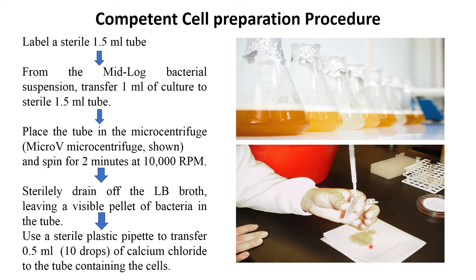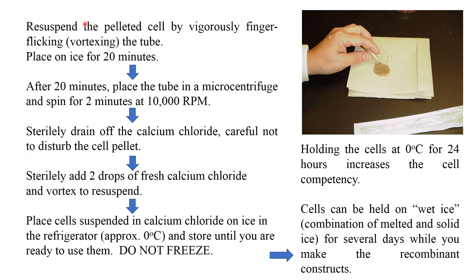After centrifugation, drain off the LB broth leaving a visible pellet of bacteria in the tube. Then use a sterile plastic pipet to transfer 1.5 ml of calcium chloride to the tube containing cells. Re-suspend the pelleted cells by vigorous vortexing, then place on ice for 20 minutes.